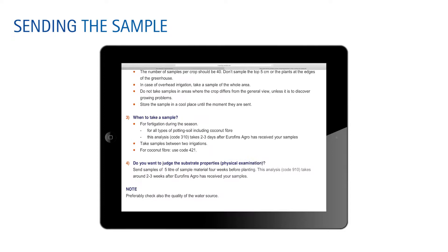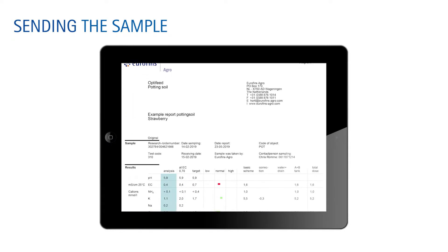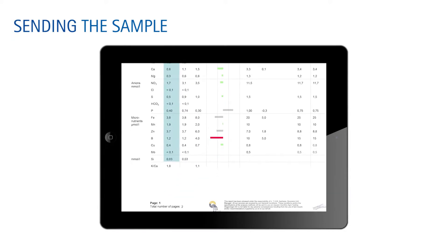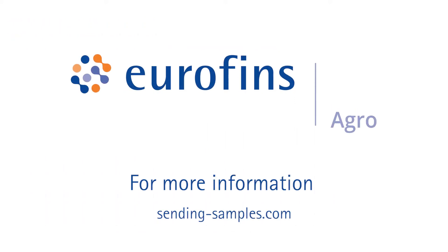Within one day after reception of the sample in our lab in Wageningen, you will receive an analysis report. This report provides you with all the relevant data you need to improve your production and quality. Eurofins Agro.